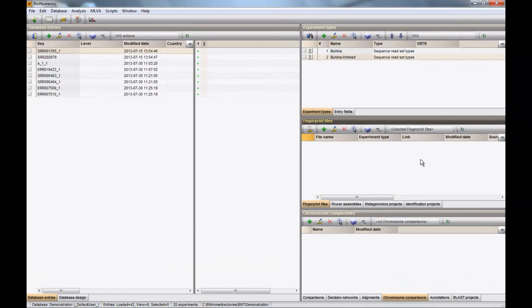In this movie, I will demonstrate how you can assess the quality of imported next-generation sequencing runs.